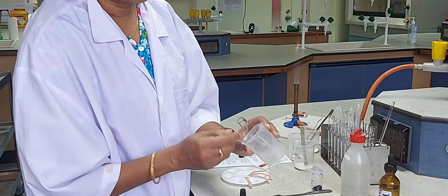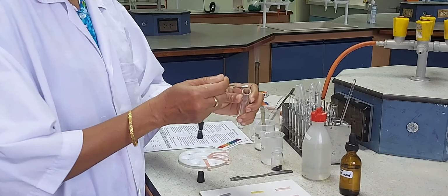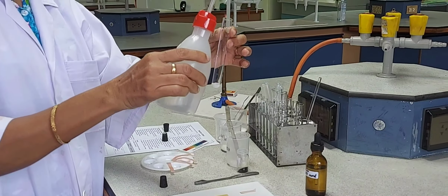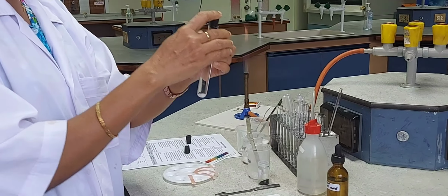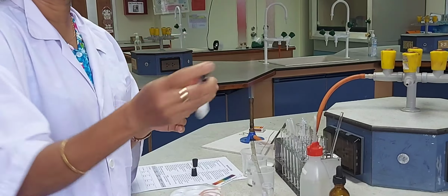So I am taking sodium hydroxide pellets into the test tube and adding water. Bung the tube and shake it well to see the solubility of sodium hydroxide.